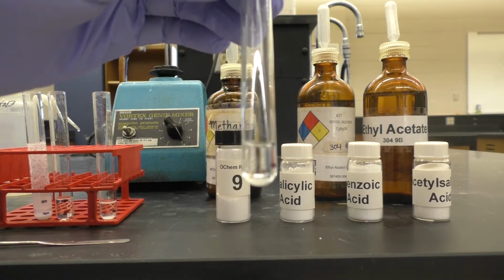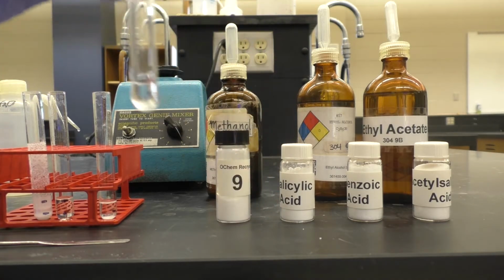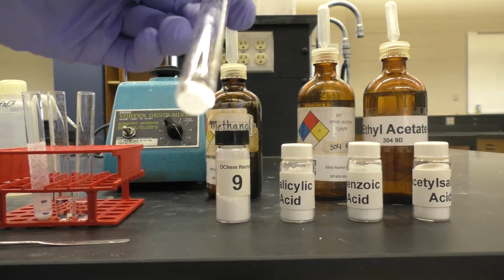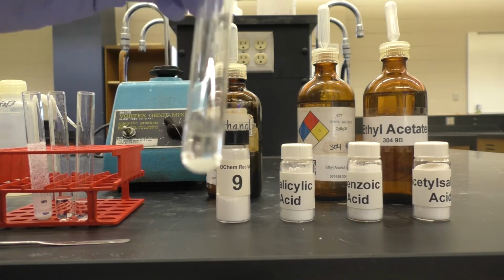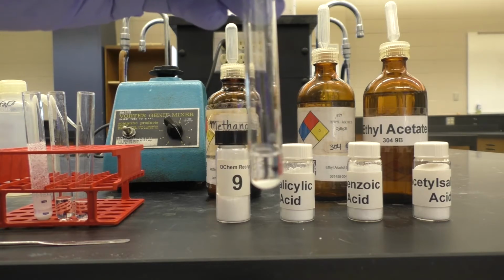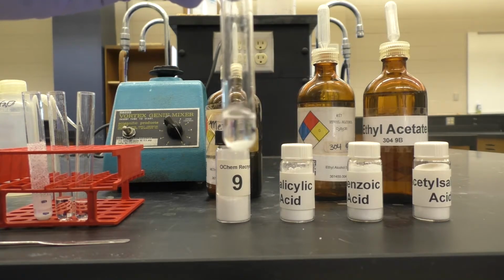Ethanol is similar to methanol. There is undissolved material at the bottom, but not very much at all. This is not going to be an appropriate solvent for recrystallization for this compound. Then ethyl acetate has a bit more solid material at the bottom, but I'd say we've dissolved probably about half of the material. It's a little less soluble, but really still not very ideal for a recrystallization. You wouldn't get a lot of the material back. We probably dissolved about half here just at room temperature. That's not going to make for a good recovery later on.